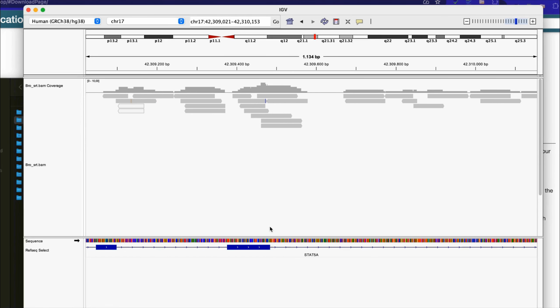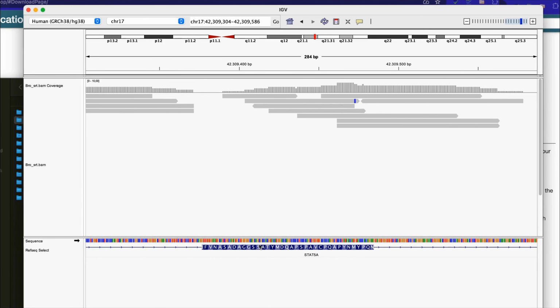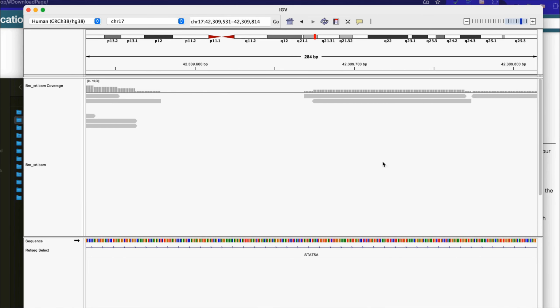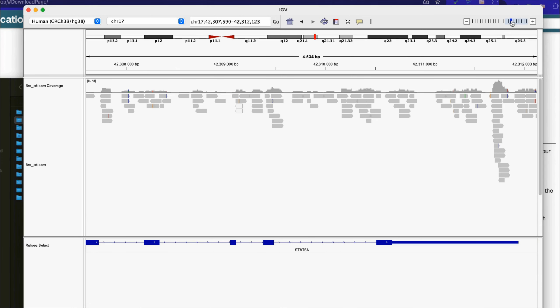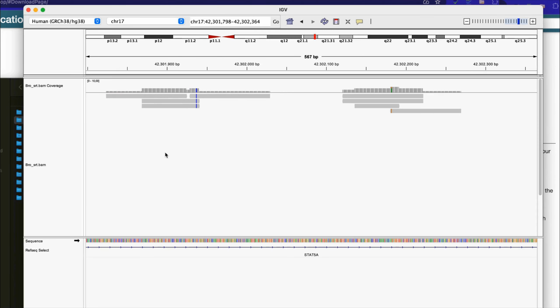If you zoom in, you will see the sequence information and translation, and those little colored blocks mean discrepancy to the reference genome, which might mean some polymorphism or not, or simply sequencing error. So don't be so overexcited if you see discrepancies. That's how you open and watch a single BAM file.